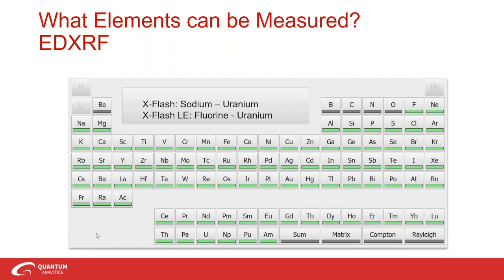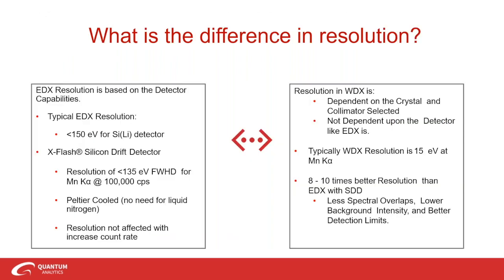The great thing about energy dispersive is that it's very accurate and sensitive to heavy metals analysis. So for those of you working with metals or looking for heavy metals, this is a fantastic tool, but that's definitely not its only limitation. It has a wide range of applications that ED is useful for.